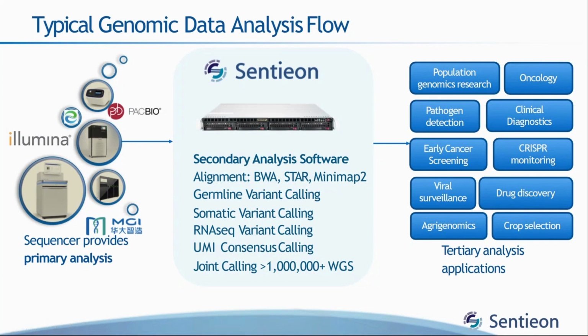from our sequencers, we want to understand the observed changes in our DNA, RNA, or the genomic data we were working on. So to do that, we require a secondary analysis software or bioinformatics tools. So based on our primary and secondary analysis results, we annotate these changes to certain conditions or experimental research, as so many options are mentioned over here. And this comes under our tertiary analysis.